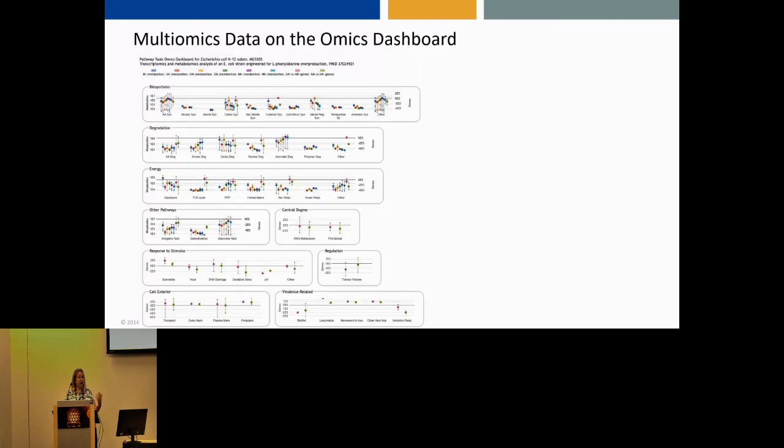And then with multi-omics data, which is again our new feature, we're just displaying the different data sets side by side in each subsystem. Here we happen to have 6 time points with metabolomics data and 2 gene expression time points. And again, each time point gets its own color. Now they're all displayed together. We have the option of using dual y-axes. So if the data aren't normalized to use the same scale, or if one of them is absolute quantities and the other is fold changes, they all show together, but each with their own scale.